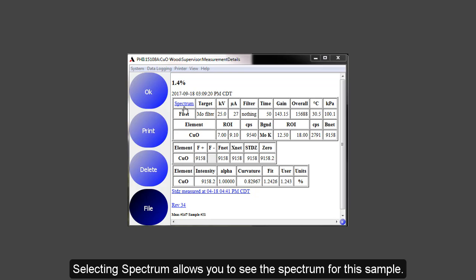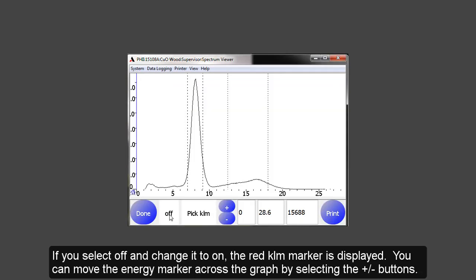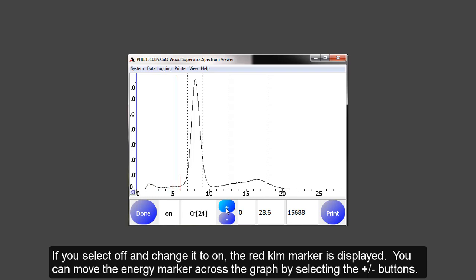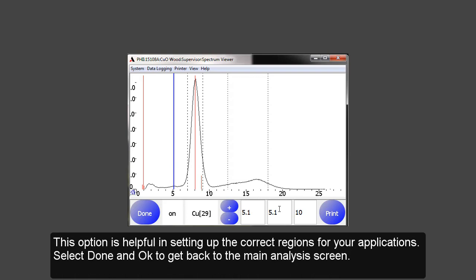Selecting Spectrum allows you to see the spectrum for this sample. If I select the off and turn it to on, a red KLM marker appears. I can use the plus or minus key to move the marker across the energy scale. Here I have copper. If I touch the screen, a blue line appears. The keV of where this line is on the energy scale is located to the right of the plus or minus keys. This option is helpful in setting up the correct regions for your application.